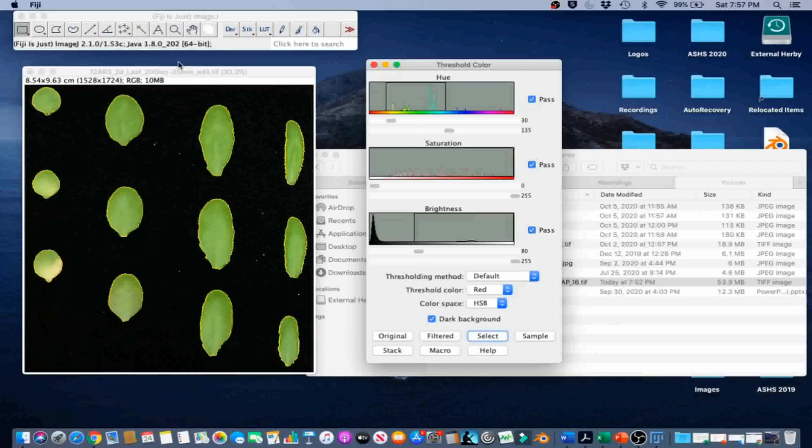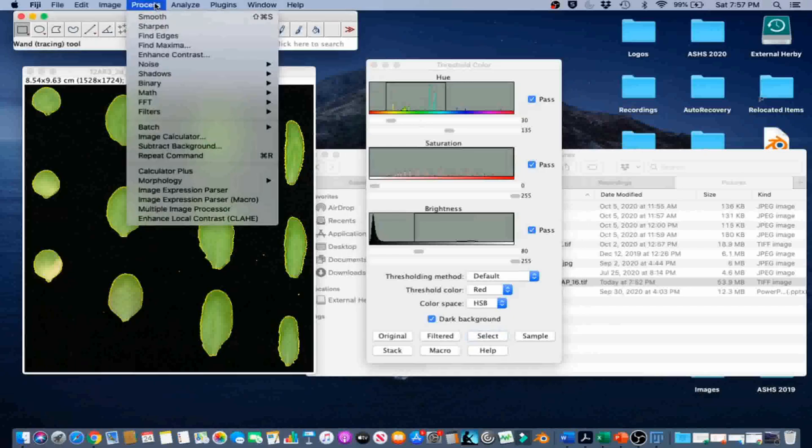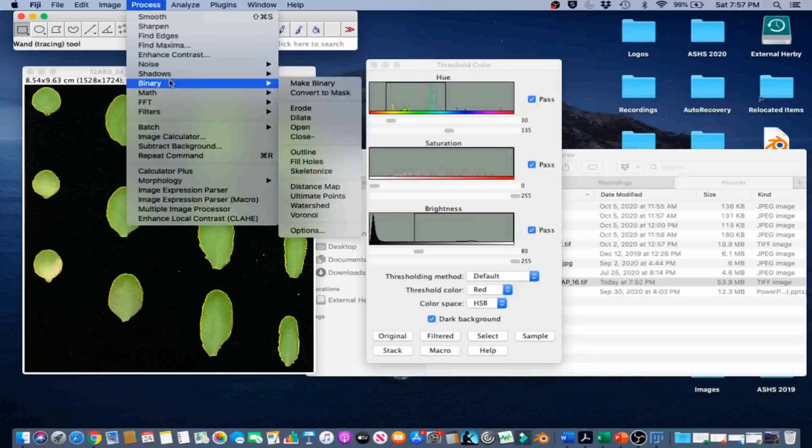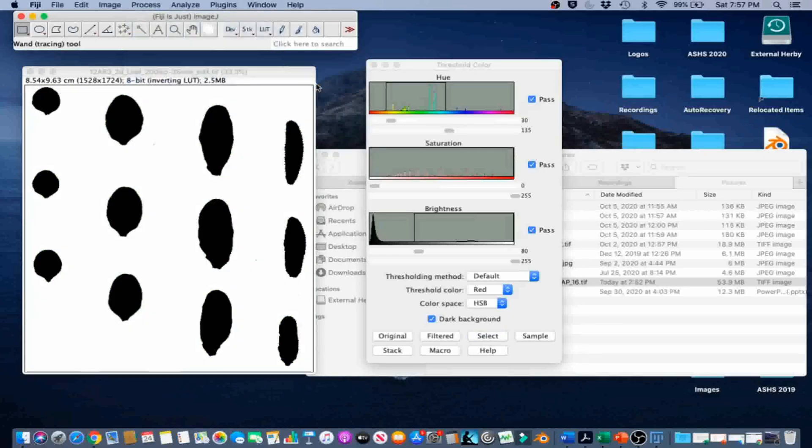Then we are going to go to Process, Binary, Make Binary to convert the color image to a binary image.